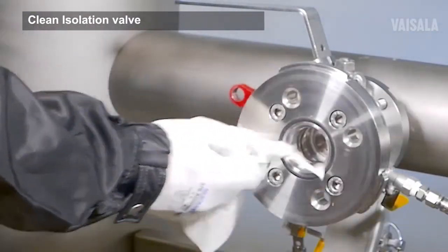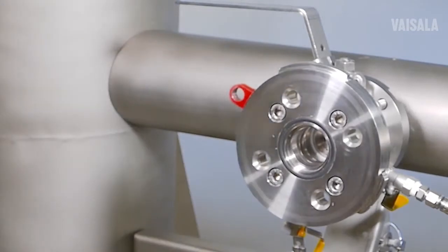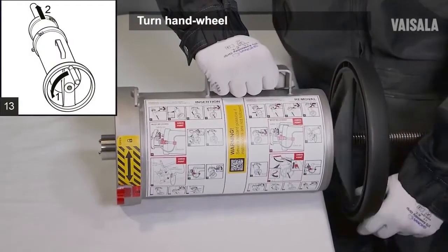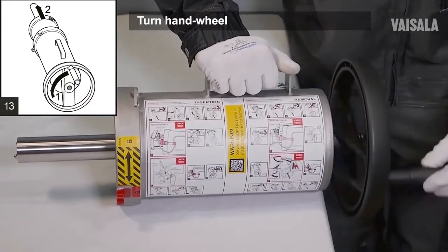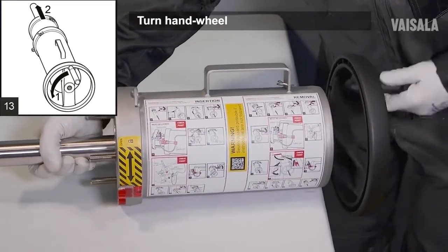Clean the isolation valve. Put the retractor with sensor onto a table or similar surface so that the hand wheel has space to turn. Turn the hand wheel counterclockwise to drop the thread.